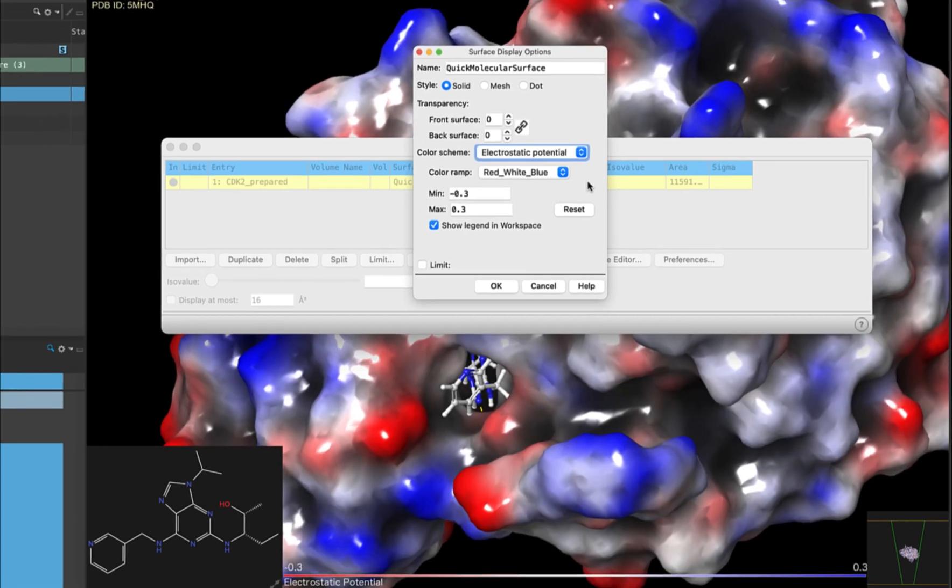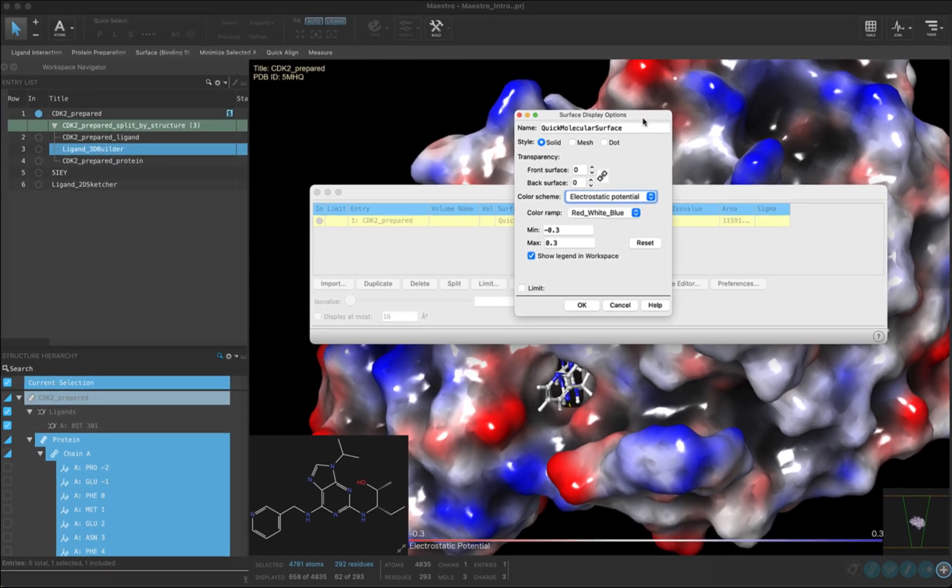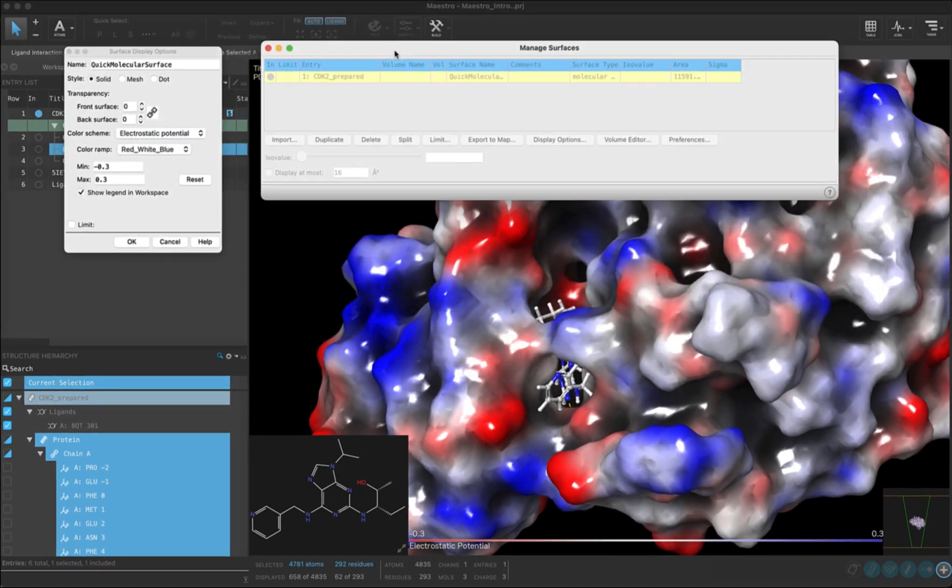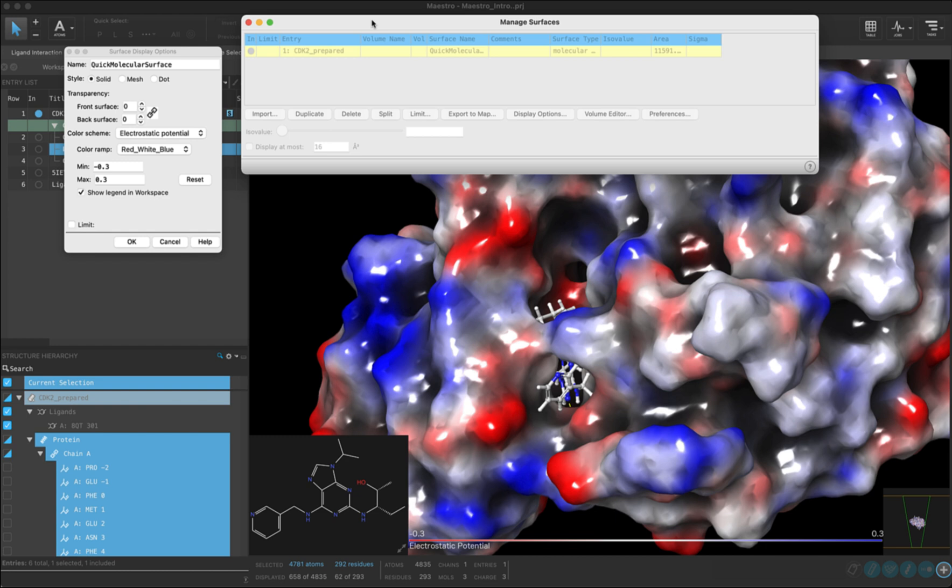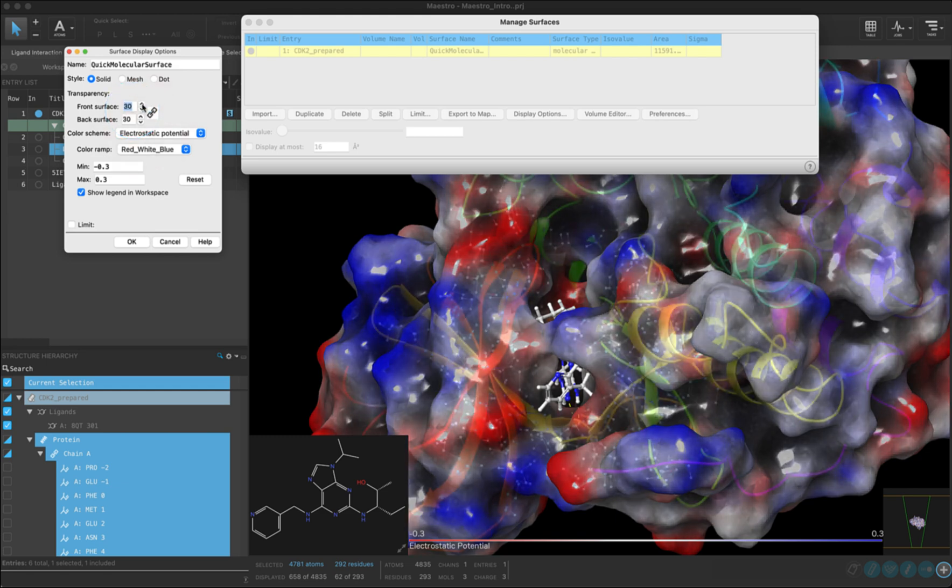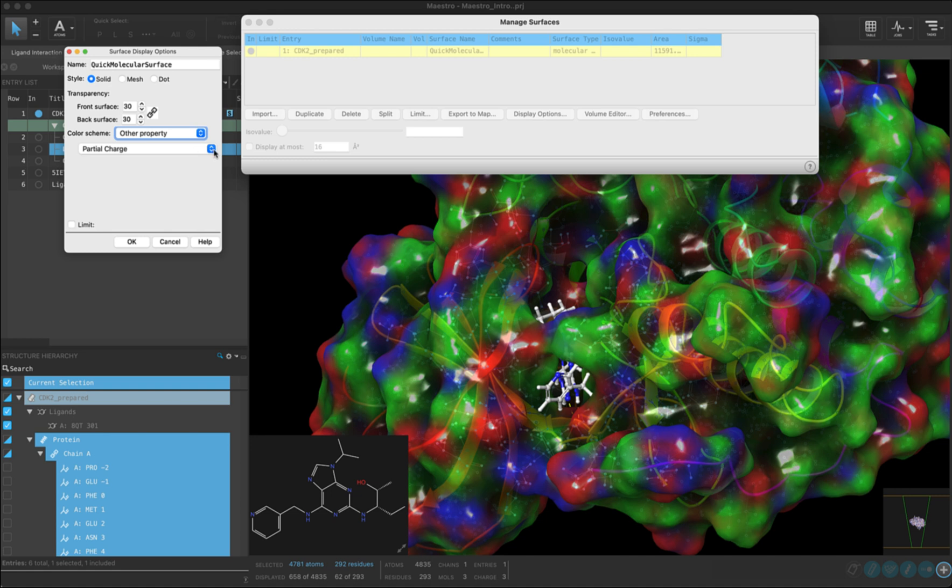Let's move these panels out of the way a little so we can see our newly rendered surface. You can also change the transparency of a solid surface by increasing the front surface transparency with arrows here. Now you can see through the surface to the secondary structures of your protein. You can also change the surface color to some other property, including partial charge, and several others. Click OK to exit out of the manage surfaces panel.